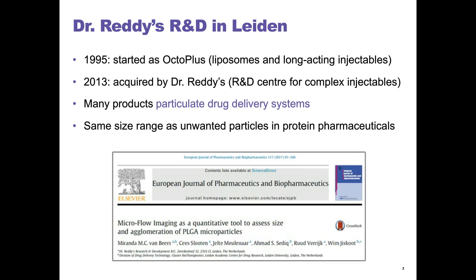And these type of products really need in-depth particle characterization techniques. Most of our products fall in the same size range as unwanted particles in protein pharmaceuticals. And for this reason, we started a collaboration with the group of Professor Wim Jiskoot at Leiden University in the Netherlands, who's an expert in the field of therapeutic protein formulation.